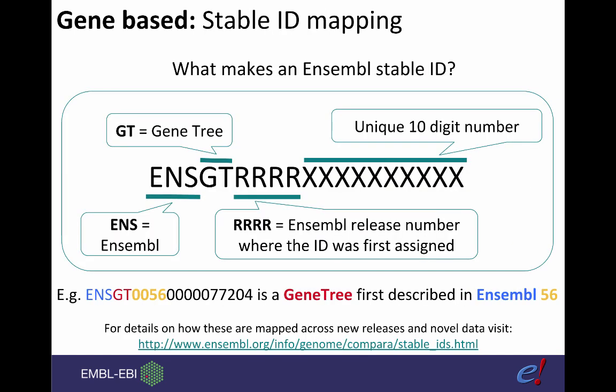As I said earlier, we assign a stable ID to our trees and if they change when new data is incorporated into Ensembl, we keep the ID the same and you can use our ID history converter to see when the tree was updated. Similar to other stable IDs for genes, transcripts and proteins, these start with ENS for Ensembl. The GT in the name stands for gene tree just as ENSP is for protein and ENST is for transcript. The four R's are unique to gene trees and this shows the release version of when this gene tree first occurred. So if we created a new gene tree in the current release, Ensembl 92, then this would be 0092. This is followed by the unique identifying number which is 10 digits in length.